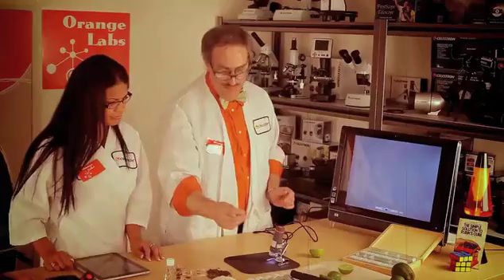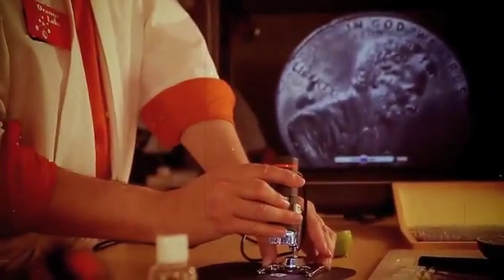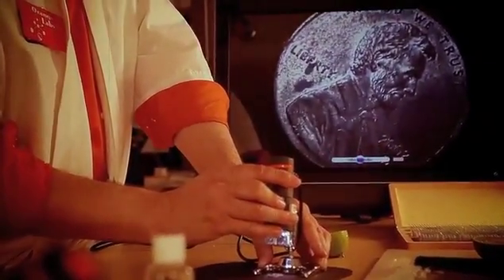Let's try something else. Like a penny. Oh, that's a good one. Wow, even at low power, Abraham takes up the entire screen. He sure does.